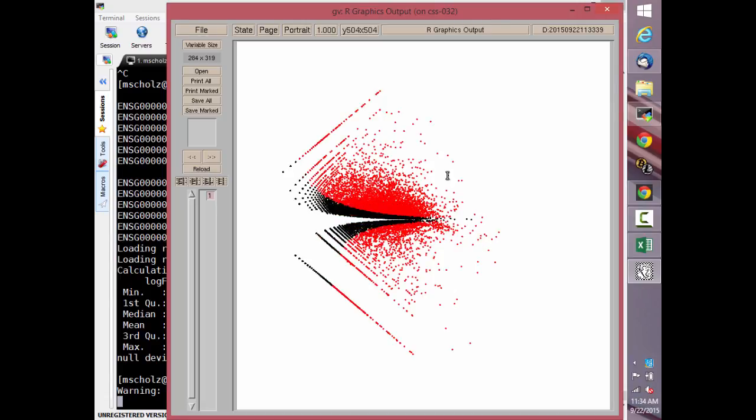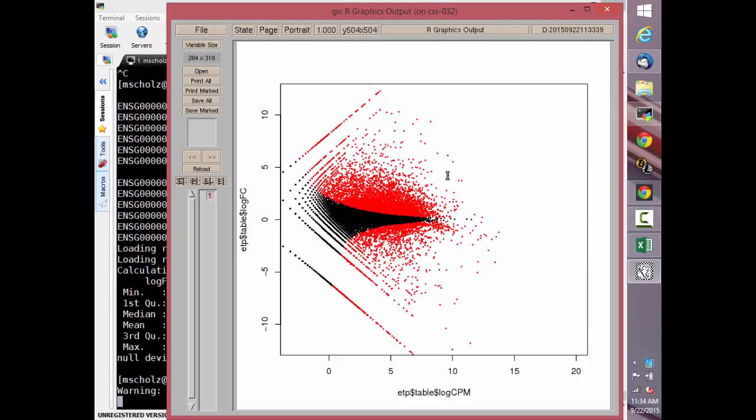demonstrating. Is an FDR of 0.1 pretty standard? No, 0.1 was because the data wasn't showing anything at, say, 0.01 or 0.05. So what are we seeing here, right? We're seeing exactly what you expect: a lot of differential expression is going to lead to almost every case, if it's out here, being accepted as different. All you're doing by changing it is just editing the edges of that curve.